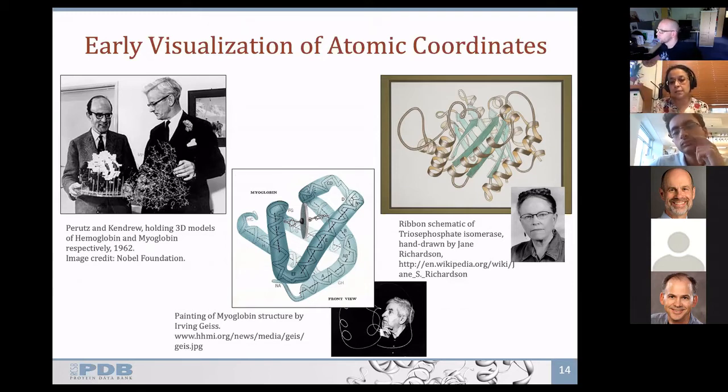It is stylized and connected in smooth ribbons. In regions that are alpha helical, it shows up as a helix. In regions that are beta strand-like or sheet-like, you see these long arrow-like structures, where the head of the arrow points in the N to C terminal direction.